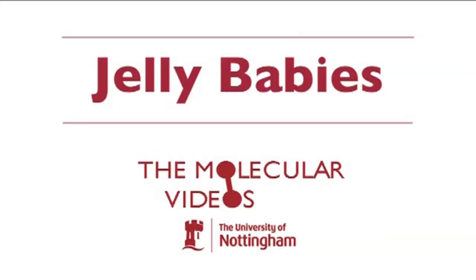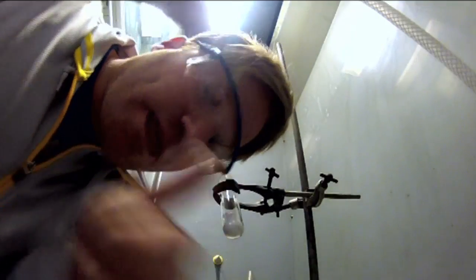We are going to do an old classic of a chemistry demonstration called the screaming jelly baby, also known as the growling gummy bear. Basically it's a reaction between sugar and potassium chlorate and it yields carbon dioxide and water.